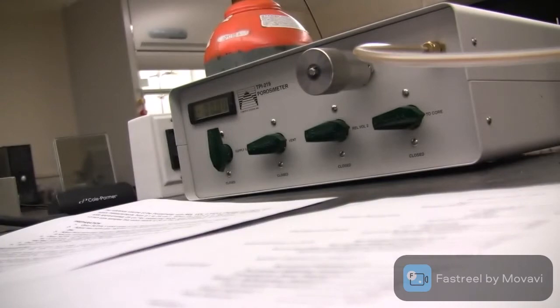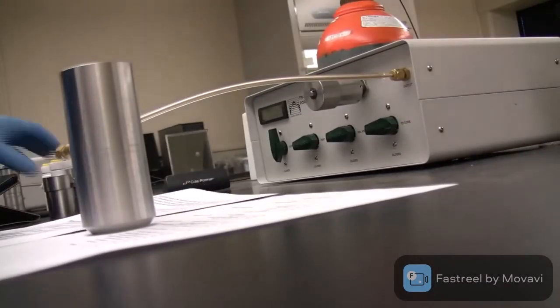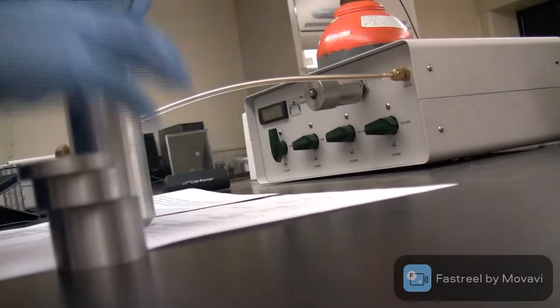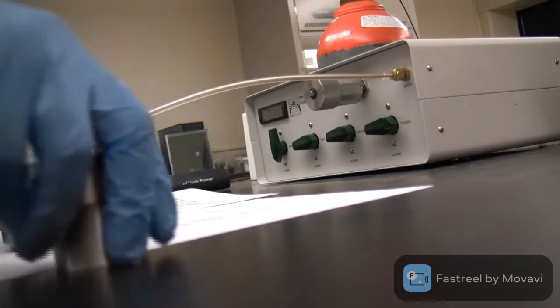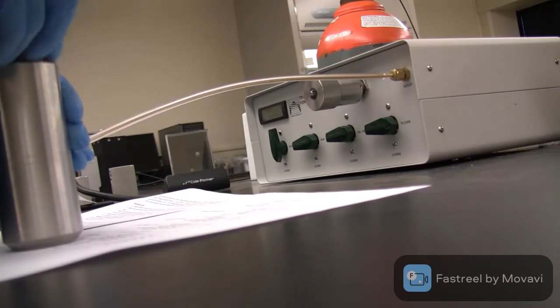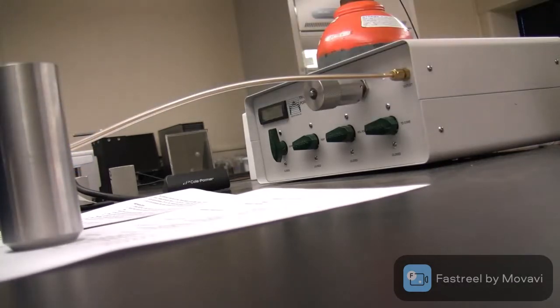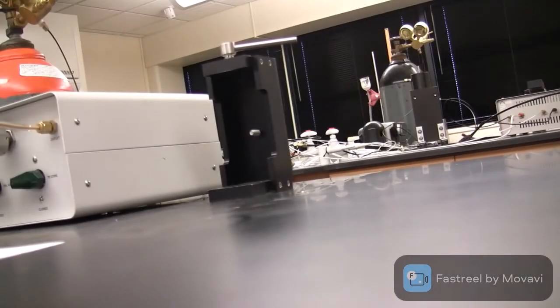Okay, next step is to fill this with all the billets. So let's put our billets in there. And then cap it with its cap, and after that you put it in here.